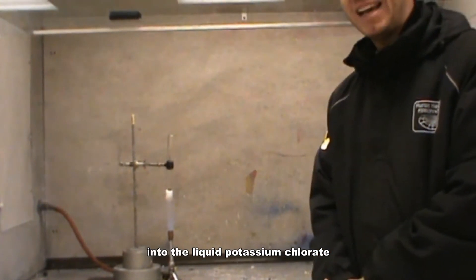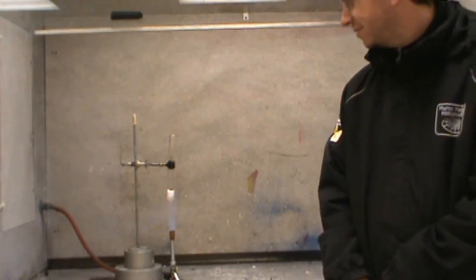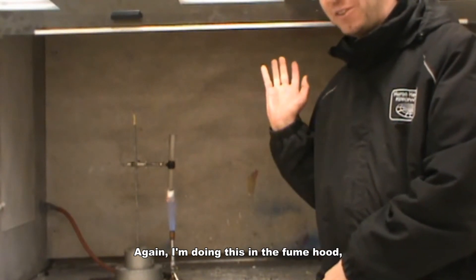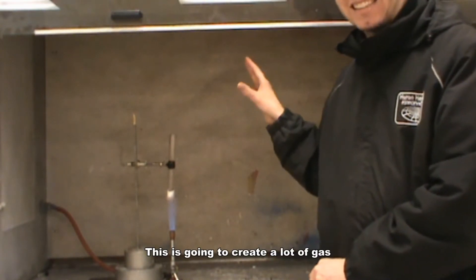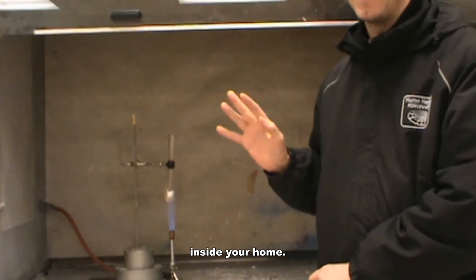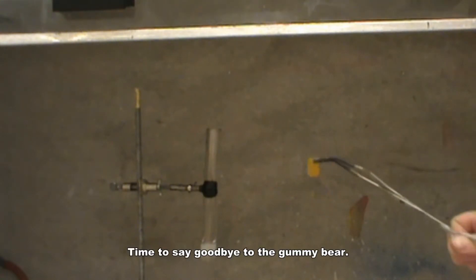When this is fully melted, we will drop the gummy bear into the liquid potassium chlorate and watch that release of energy. I'm doing this in the fume hood, so I've got the vents on — this is going to create a lot of gas and I don't want that gas filling up in the air. You should never do any of this inside your home.